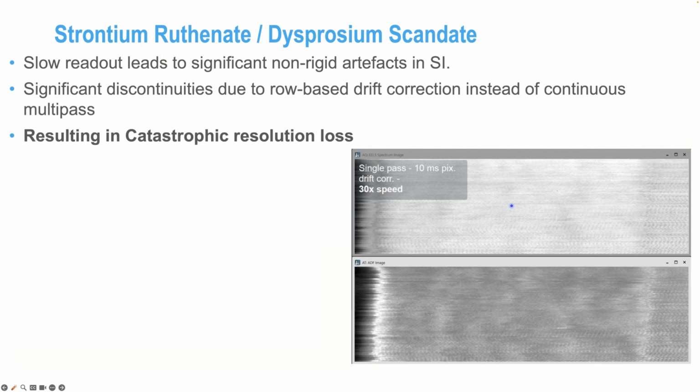And this is going to be true of many experiments. The speed makes it incredibly easy. If those pixels are in the microsecond realm, this kind of acquisition becomes routine. If you're doing milliseconds or higher, the chance of success drops quite drastically.